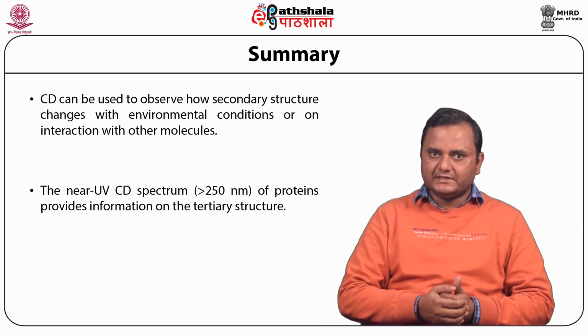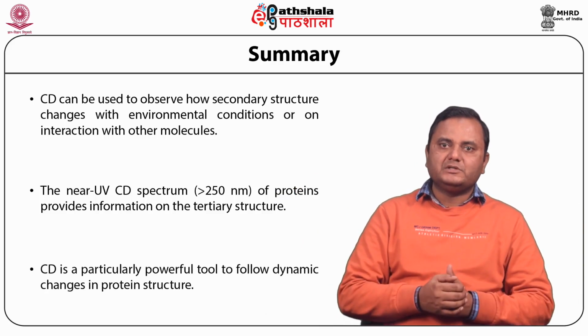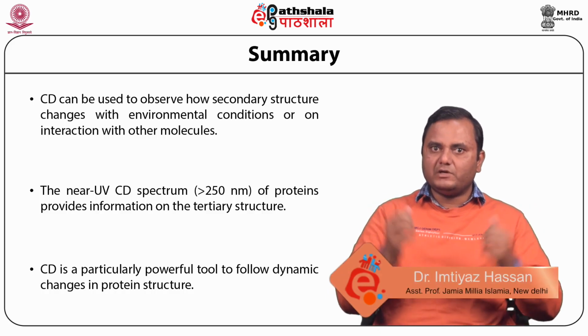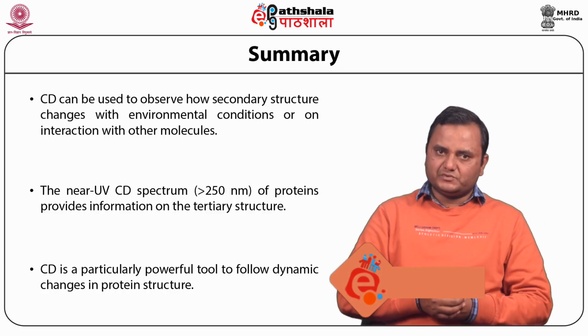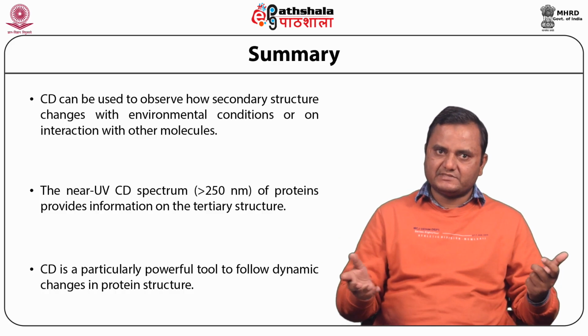Finally, CD is a very powerful tool to follow the dynamic changes in protein structure, which requires a very low amount of protein and gives you a lot of useful information about protein structure, conformation and dynamics. Thank you very much.